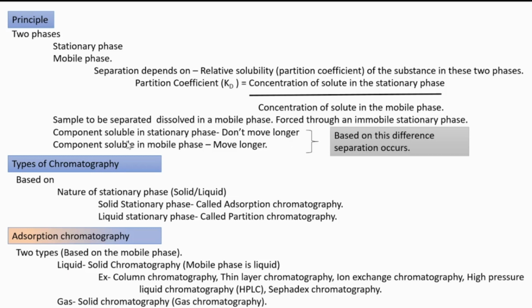And now consider the case of the other one. Those components have less solubility in the stationary phase. If it is less soluble, then it can move longer distances. Such substances move longer. Those substances have solubility, but more solubility in which phase? Mobile phase, not in the stationary phase.